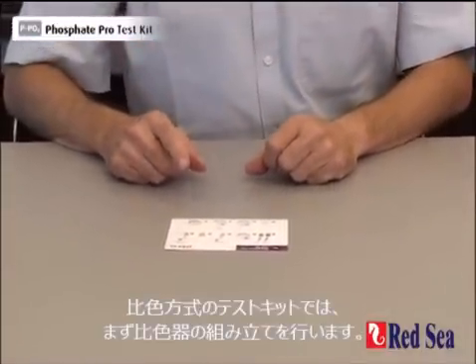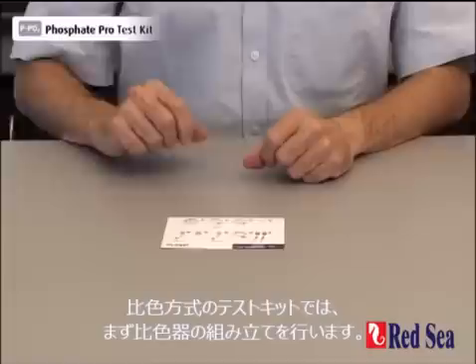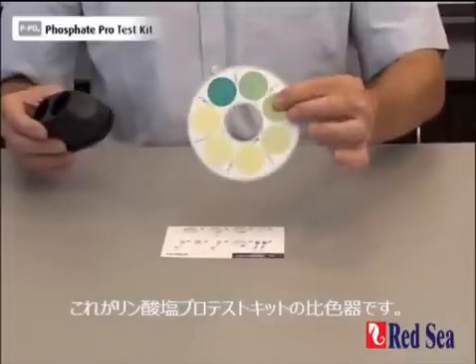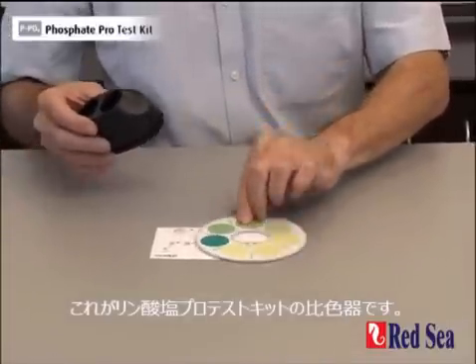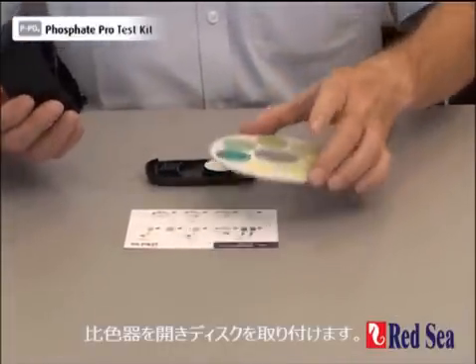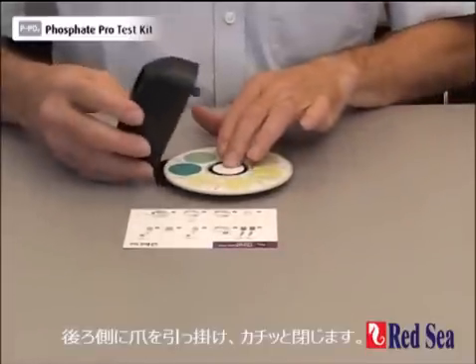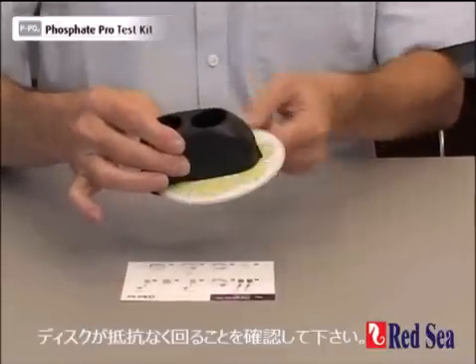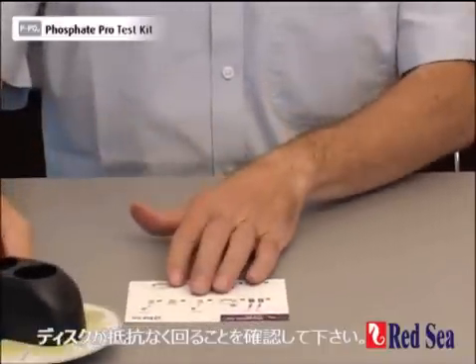With the comparator test kits, the first thing we have to do is assemble the comparator. This is the comparator for the phosphate. We open up the comparator from the bottom, place the disc in position, and hinging the body from the back, we snap it in position so that it rotates easily. We now put it on one side.